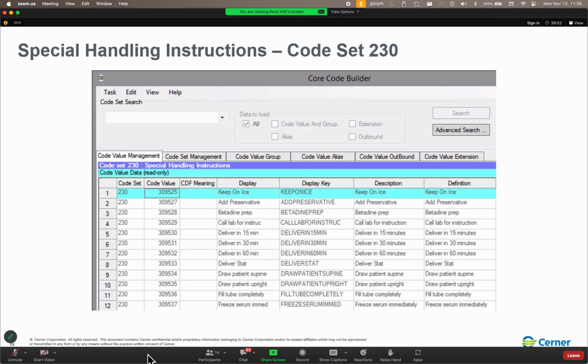Now, Stephen's got a question out here. In theory, would a warning be triggered if you're reaching the upper limit of the bucket? So would a warning be triggered if we reach 9,995 in our 4-digit sequence? No.